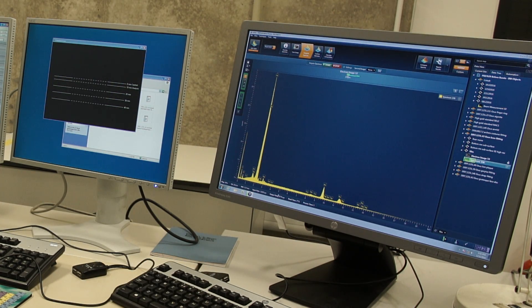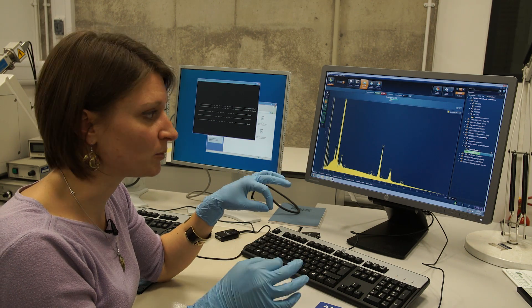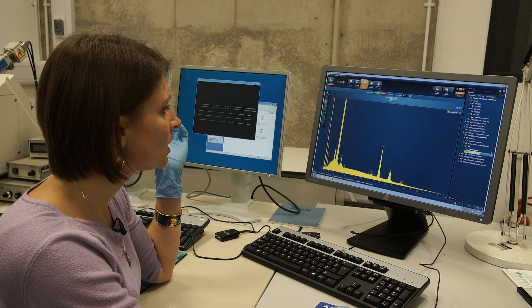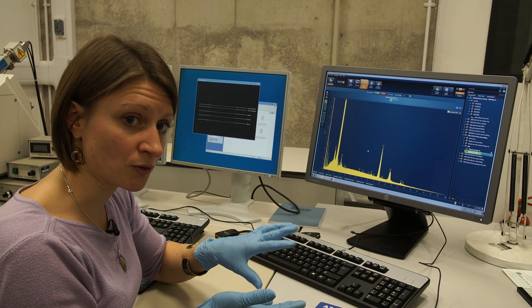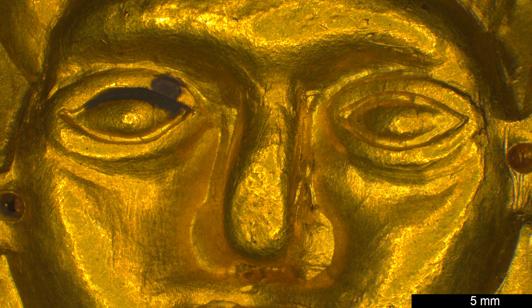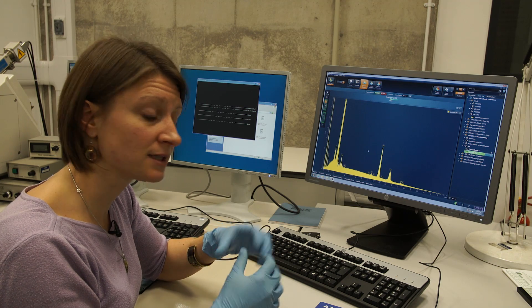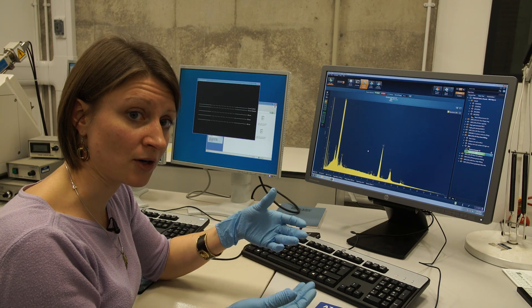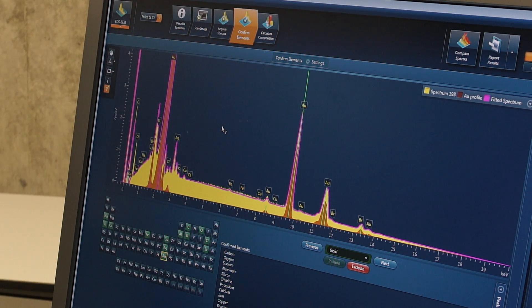While the spectrum is being acquired, you can watch it live and see the elements which are being detected. What we see here is the composition of the surface of the object, and in our case we can see that there is a lot of gold with some silver and copper. What has to be borne in mind, though, is that due to various factors such as burial environment or surface treatment applied by the goldsmiths, some of the alloying elements — copper and possibly silver — may have been removed from the surface. So it may be that in the actual core of the object, the silver and copper contents are higher than what we detect here on the surface.